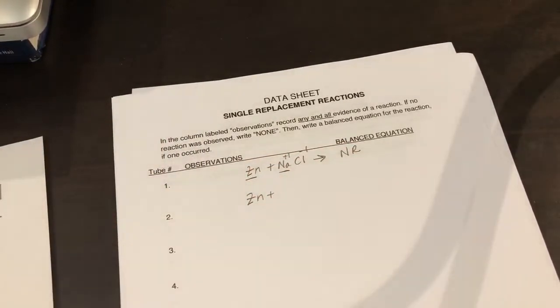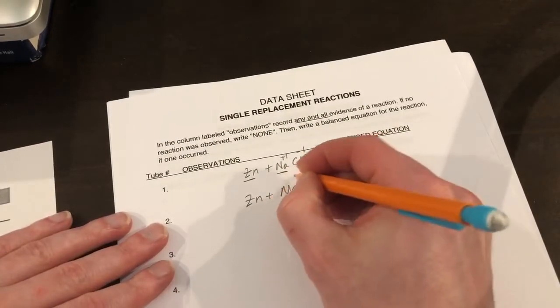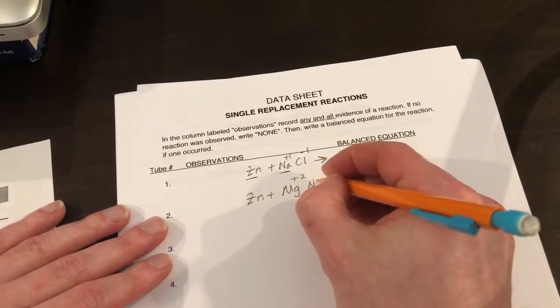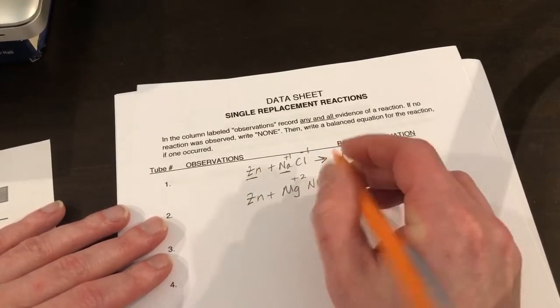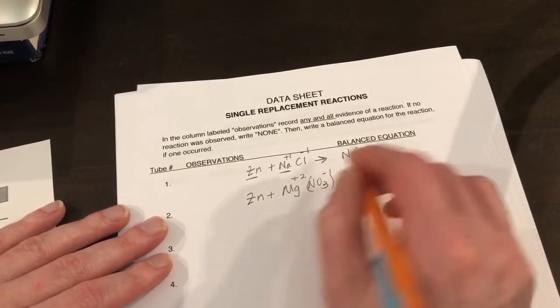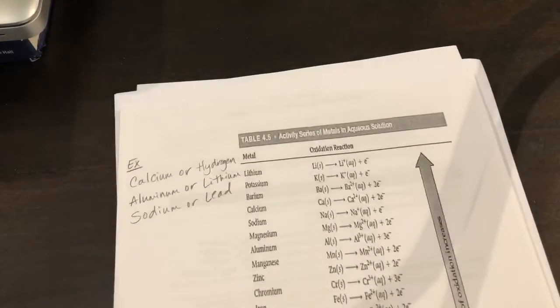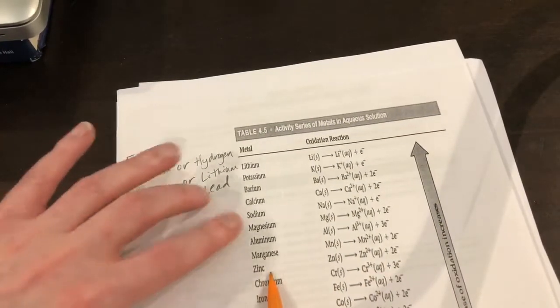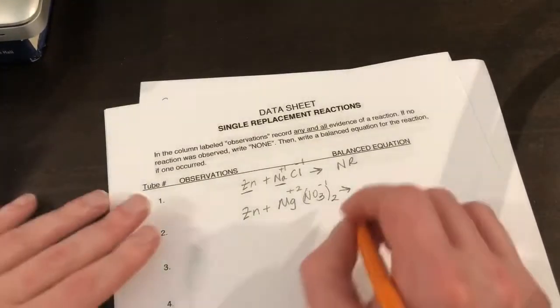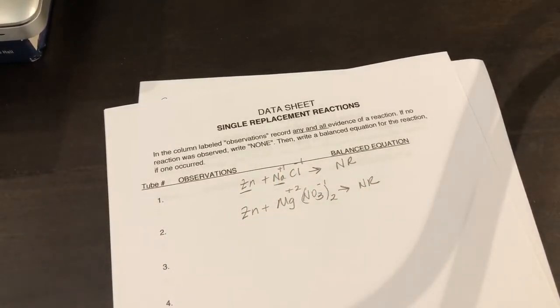It says we're going to do zinc and magnesium nitrate. Magnesium is Mg with a +2 charge. Nitrate is NO3 with a -1 charge. Now we're going to crisscross just like that. Now we're going to look at our activity series. Zinc and magnesium. Zinc is not above magnesium, so there's going to be no reaction. That's why we spent so much time on the activity series.